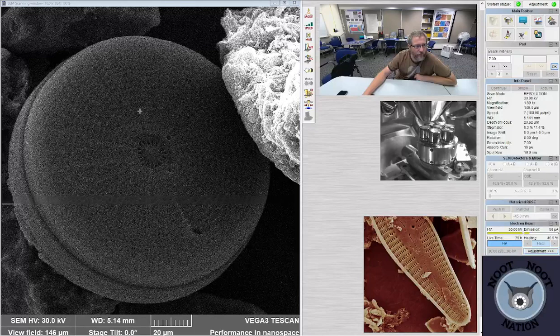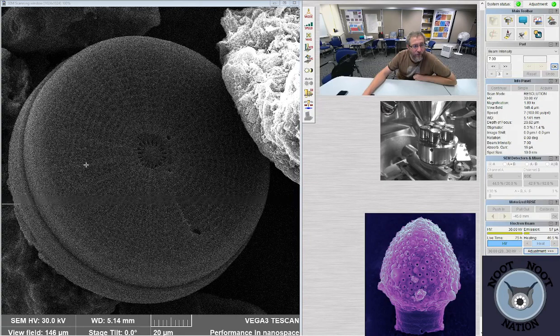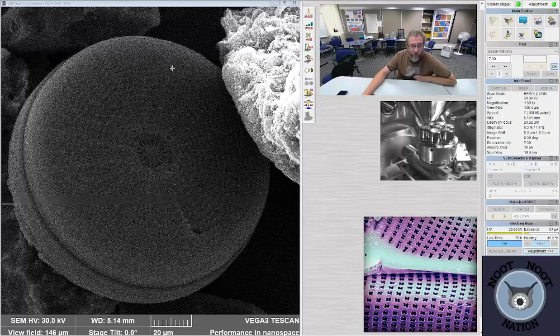We've been looking for them in the SEM for a long time now, because we'd see them very rarely in the light microscope samples when Pacific Plankton would send them to me, or she'd see them in her light microscope samples while they were still alive, and then we just never really managed to get more than just a piece of one in the SEM before now. So this is nice.